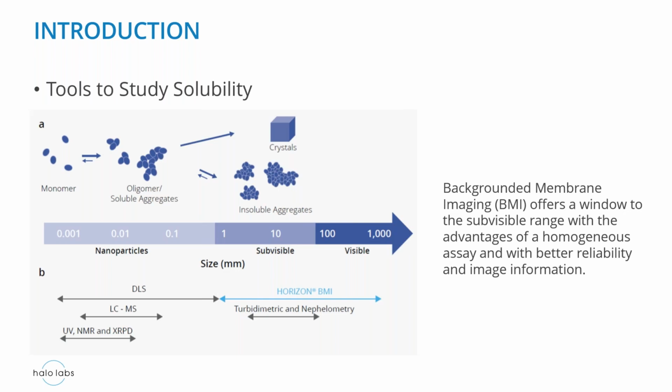They are better suited really for the molecular level. So they have a lot of problems. For example, if the media is not homogeneous, like in dynamic light scattering, you are not able to identify and characterize types of aggregates. Everything looks like an aggregate and everything looks like a huge aggregate. You cannot differentiate between types of aggregates.